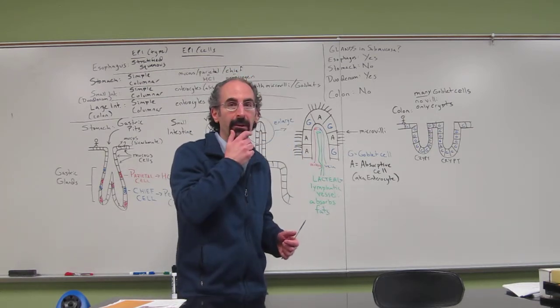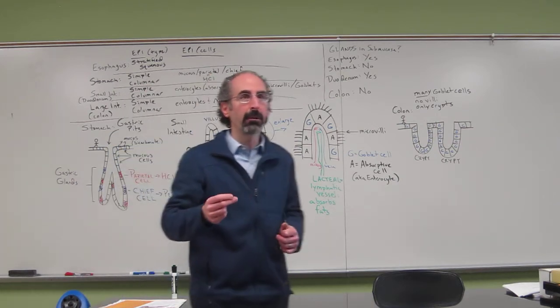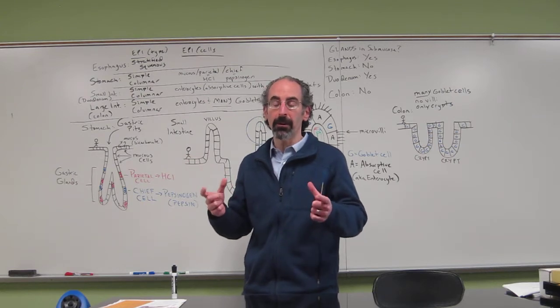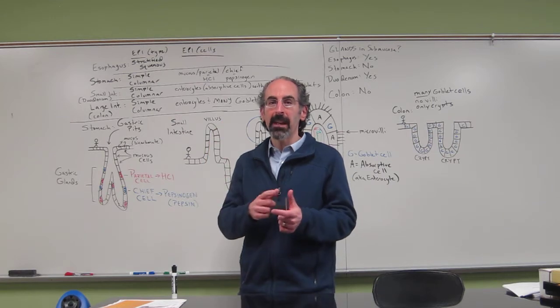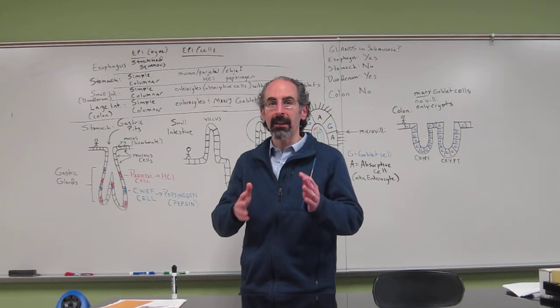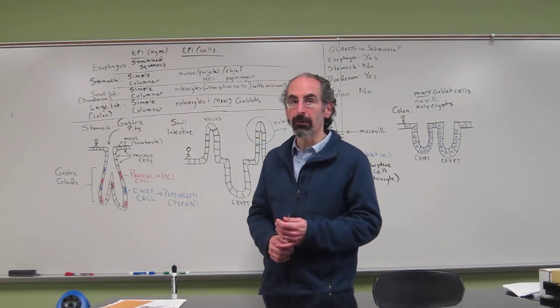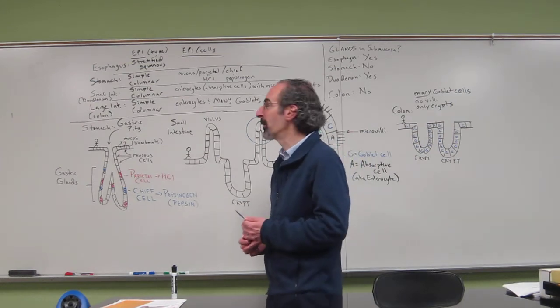the slides that we'll be showing you help to give an overview of that, so you can go through, have a mental checklist, and very quickly, when you're looking at a slide or a photo of a slide, have that mental checklist in your head. Is it showing A, B, C, or D? And if so, what features are there or not there? That allows you to limit what is what, and rule out some options and focus in on what you might be seeing and what we might be throwing at you.